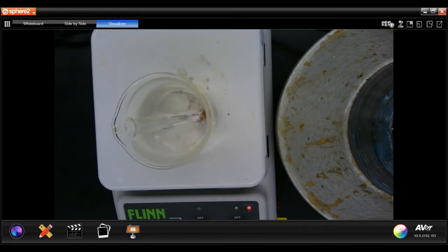I'm going to take the test tube out of the hot water bath and show you what we have, and then centrifuge it.